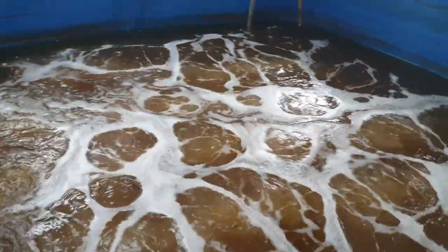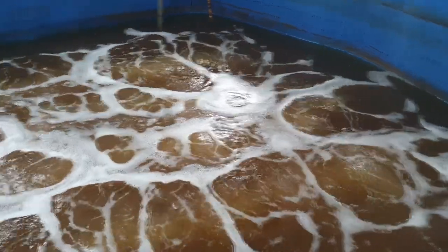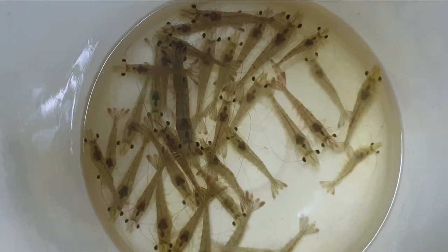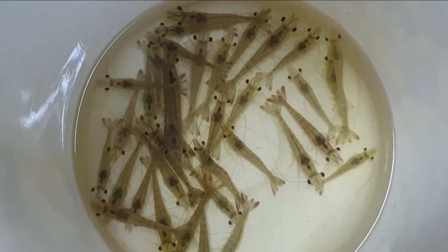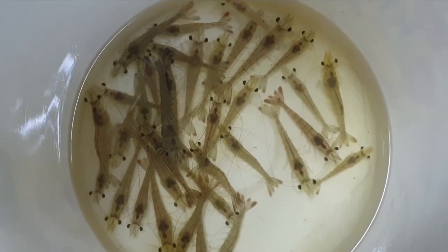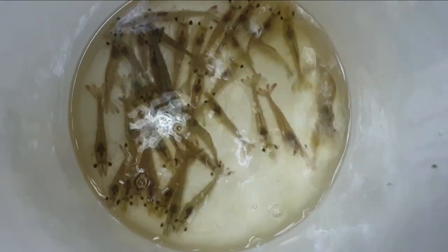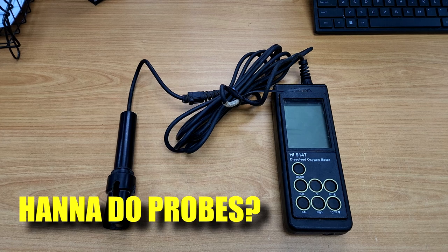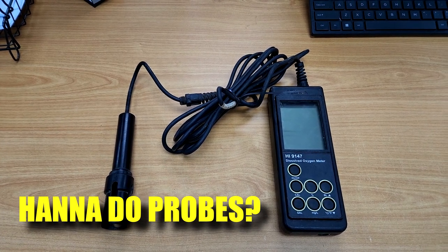Hi guys, thanks again for visiting us at RS Aquaculture. For those who are doing shrimp farming, you might already know how dissolved oxygen is very important for the growth of your shrimps, as it allows them to metabolize the feed properly and reduces your FCR. So like any good farmer, it is very important for you to measure that your DO is sufficient. In this video, I'll be going through our experiences in using HANA probes which I've been using actively over in our farms.